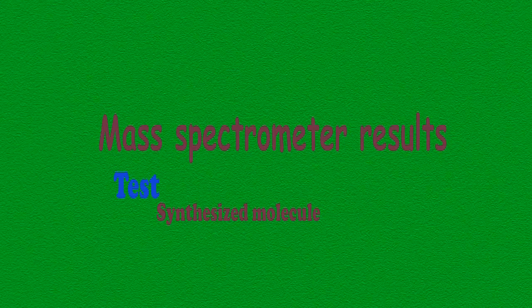Today we will see how to understand the mass spectrometer results. Anyone can think: what is a mass spectrometer and what is the use of understanding its results? To answer these questions, anyone who would like to develop their own molecule to cure diseases or to make new material. Understanding the mass spectrometer results will be very useful to test the synthesized molecule or to know the already existing molecule.